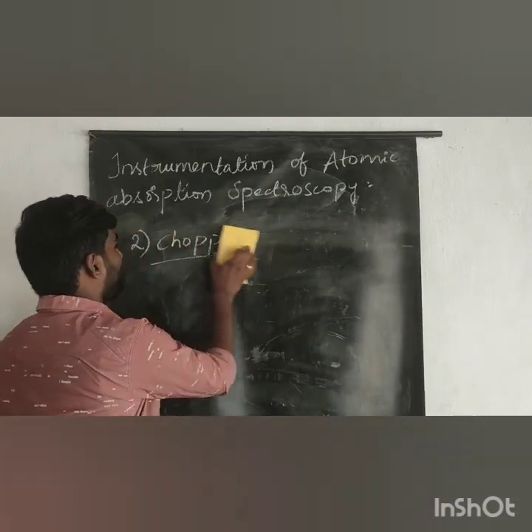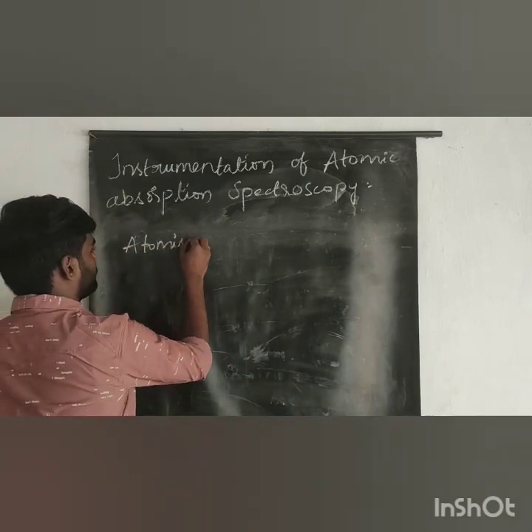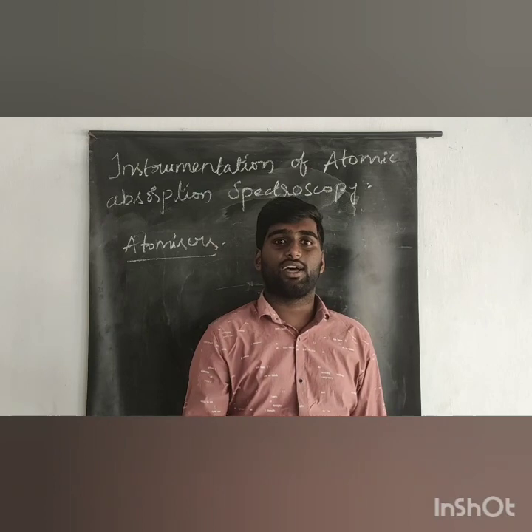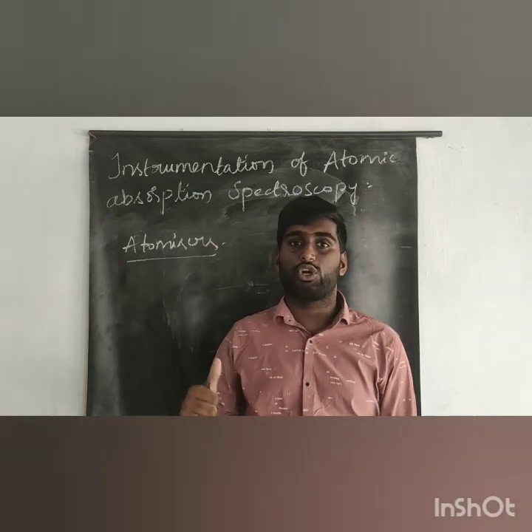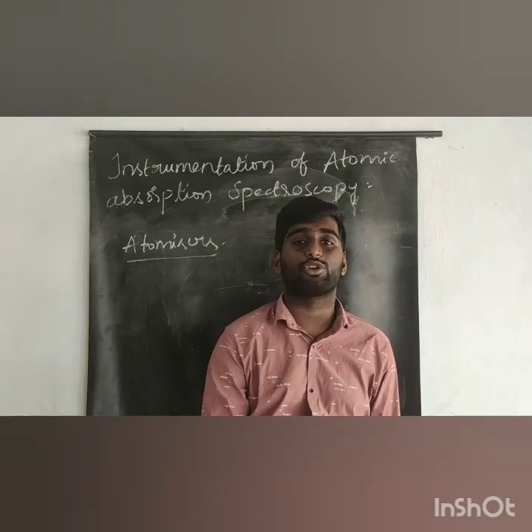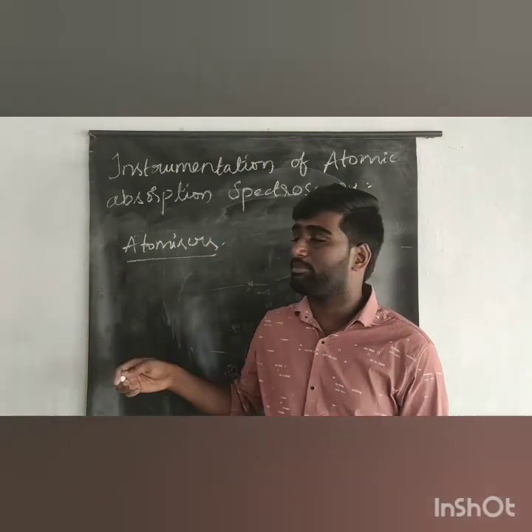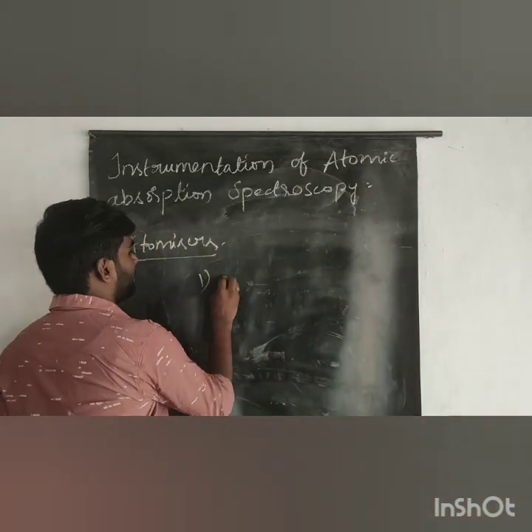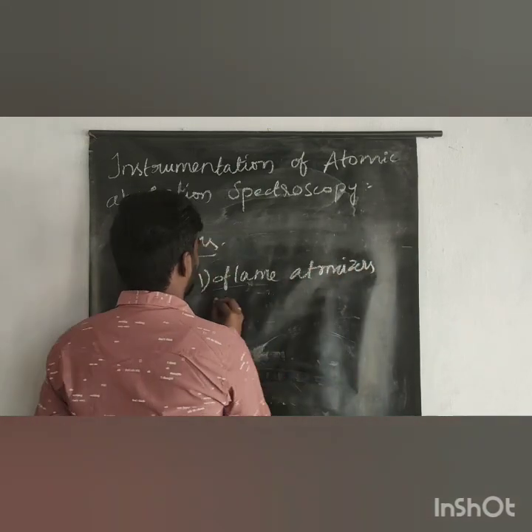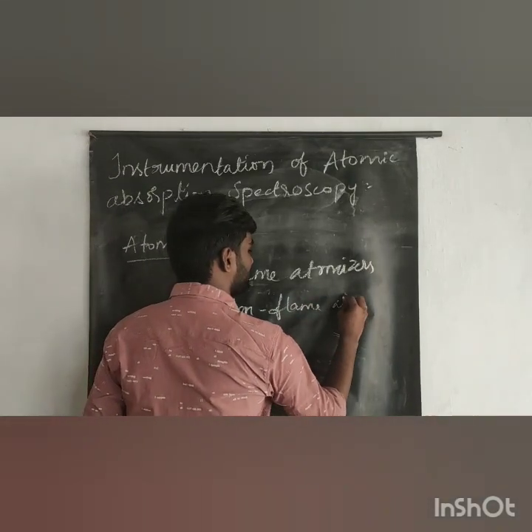And next, the flame atomizers. In order to achieve the atomic absorption of atoms, it is necessary to reduce the sample. This is done by two types of atomizers. One is flame atomizers and the second one is non-flame atomizers.